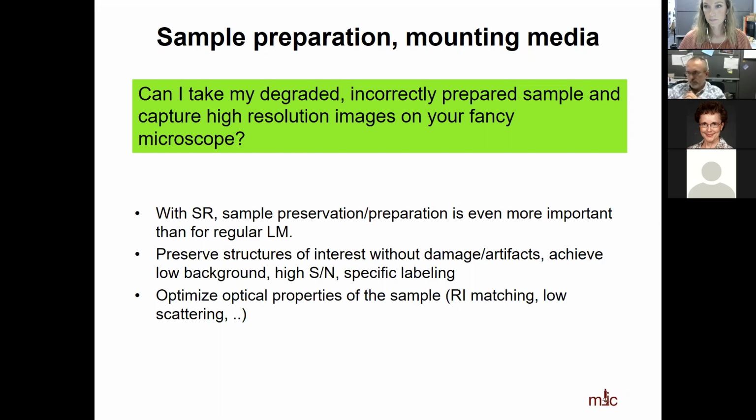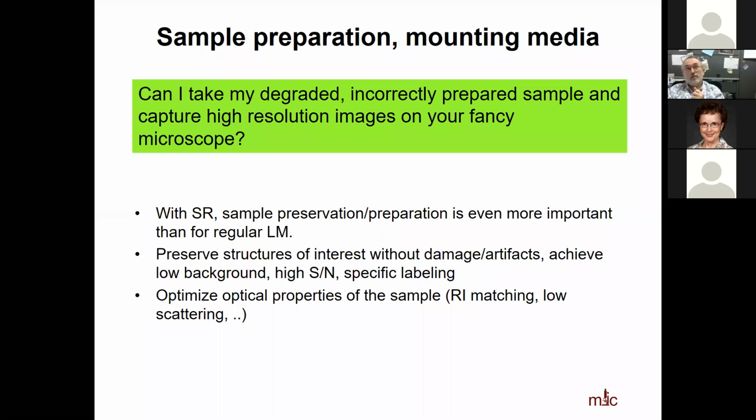Right. So how big are your samples? Well, initially they're the size of the embryo, and so we look at the embryo structurally that way. Yeah, but can you translate it for a plant biologist? Oh, okay. We're looking at 150 to 200 microns. Okay, so fairly big in terms of super resolution.